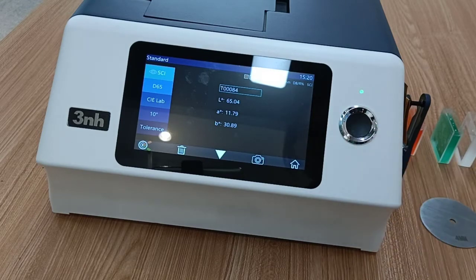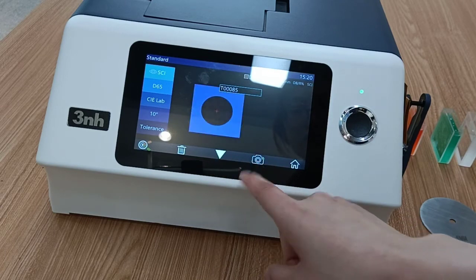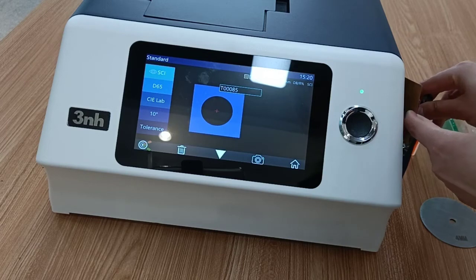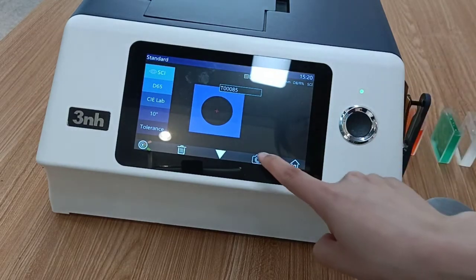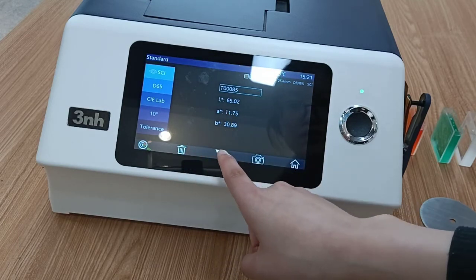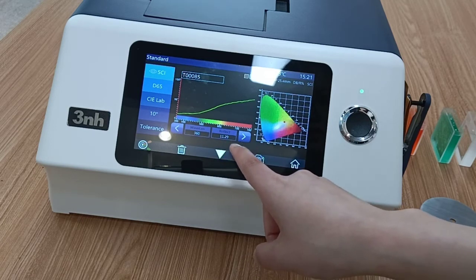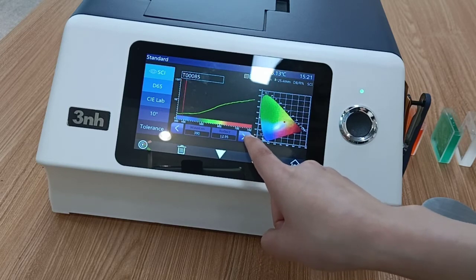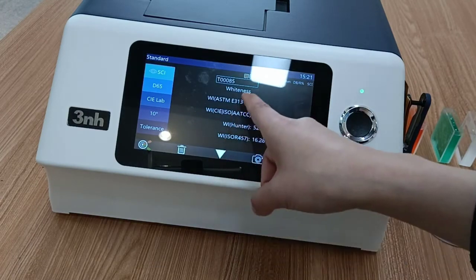Press the measuring button. We can see the LAB values have changed, and we can use the camera location function to see the color location. We can also delete these values. Clicking this icon, we can see other parameters such as reflectivity at different wavelengths, and the whiteness in different standards.